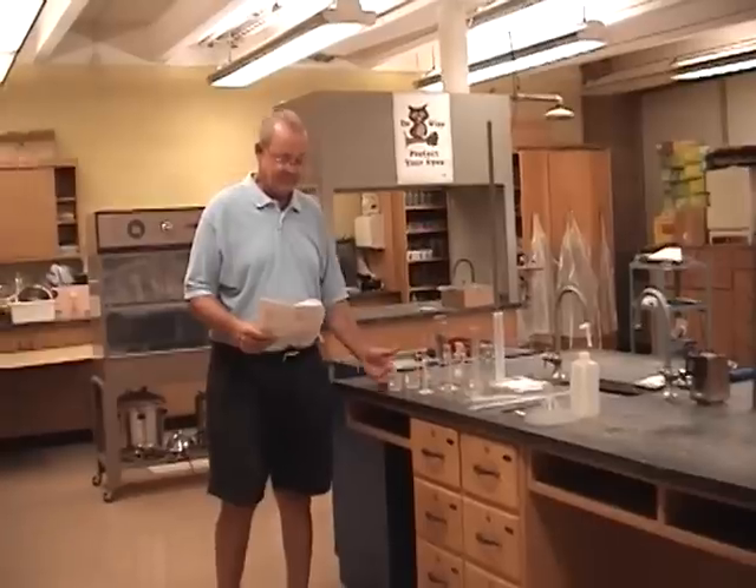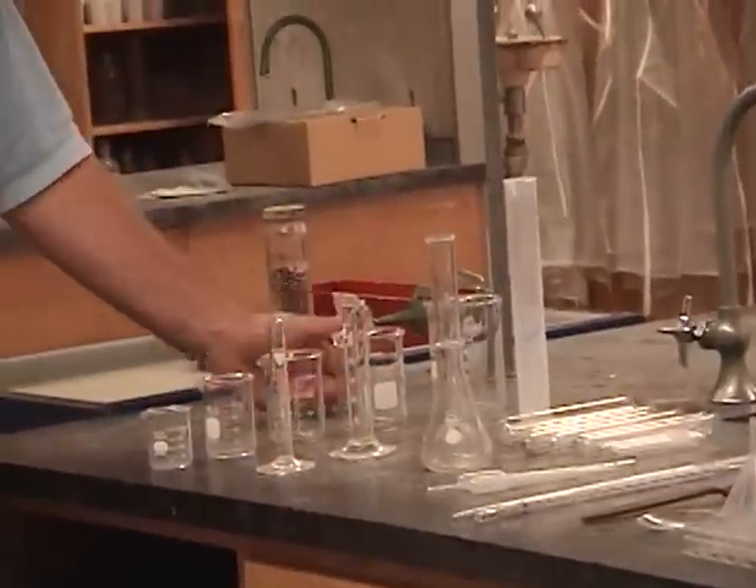We're going to start over here and use Station 1 to show Drawer 1, Station 2 to show Drawer 2, etc., until we get to Station 8 for Drawer 8. At Station 1, we have five beakers in various sizes: 50, 100, 150, 250, and 400 milliliters.